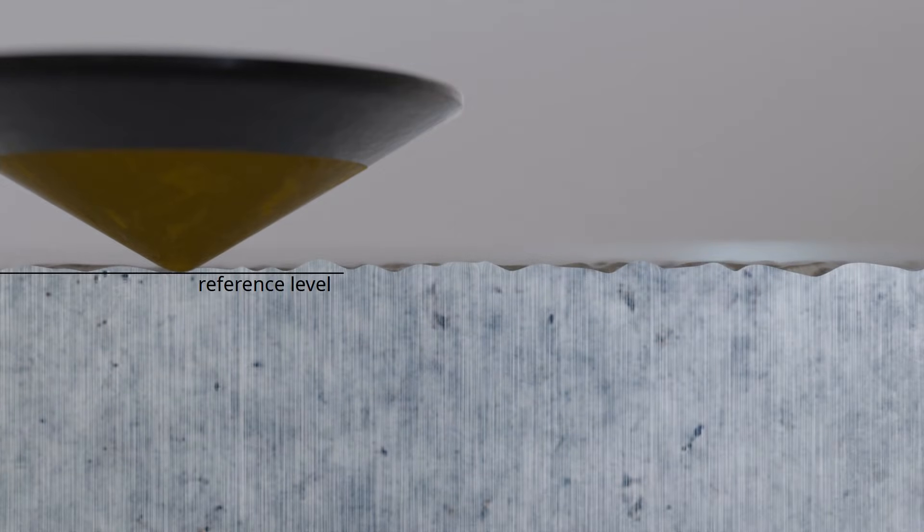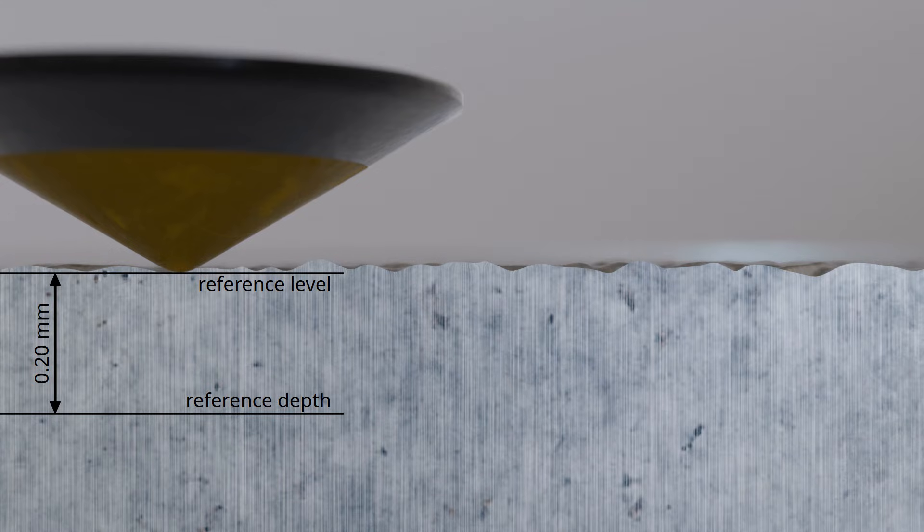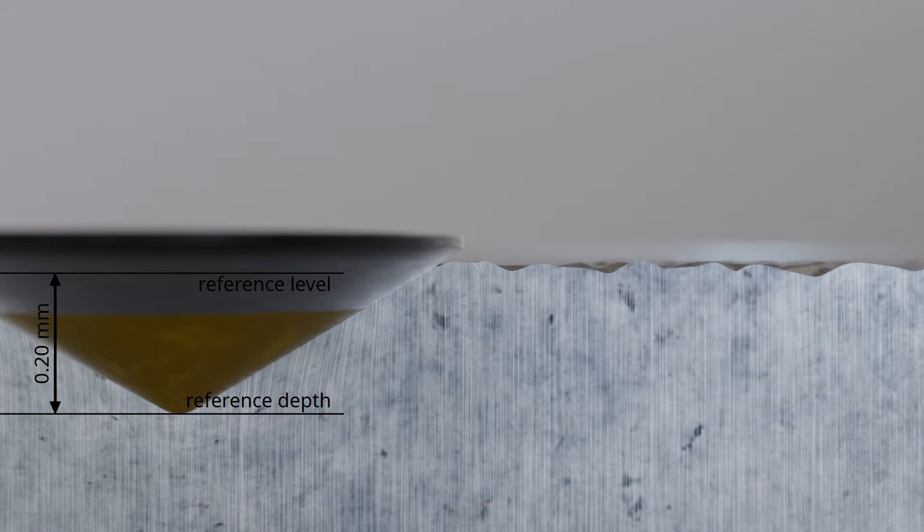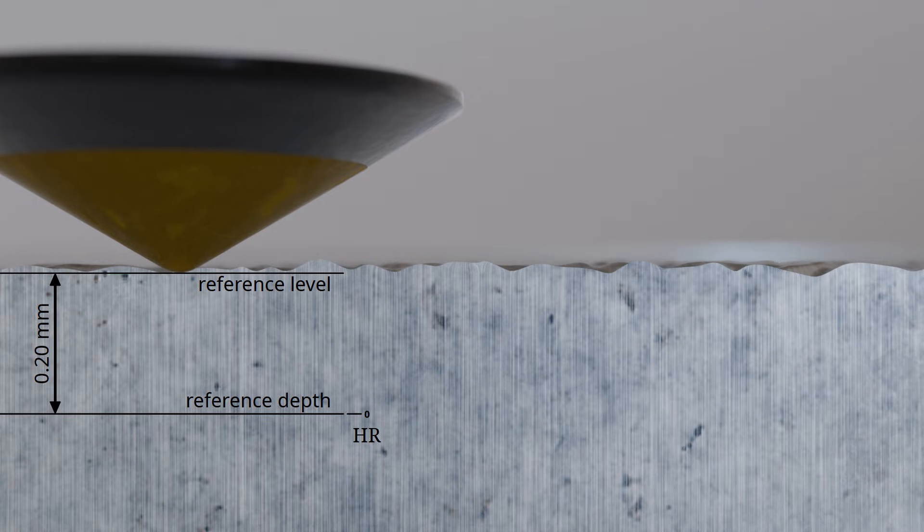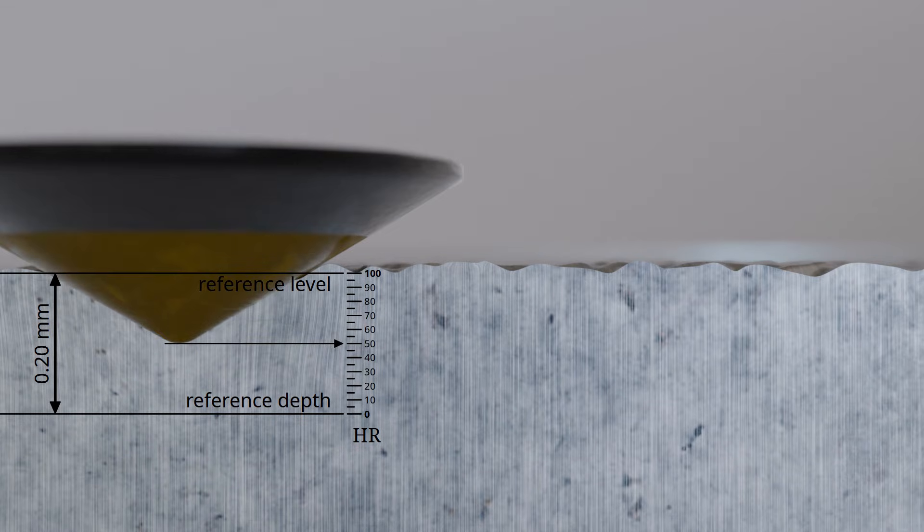When diamond cones are used as indenters, the hardness value is determined based on a reference depth of 0.2 mm. The hardness value assigned to the material depends on how close the indenter comes to this reference depth. Full penetration of the indenter to the reference depth would indicate that the material is very soft, corresponding to a hardness value of 0. On the other hand, if the diamond cone does not penetrate the material at all, it would indicate an extremely hard material, which would be assigned the maximum hardness value of 100. The scale is evenly divided in increments of 2 micrometers, so reaching half of the reference depth corresponds to half of the maximum hardness value. In this case, the material would have a Rockwell hardness value of 50.